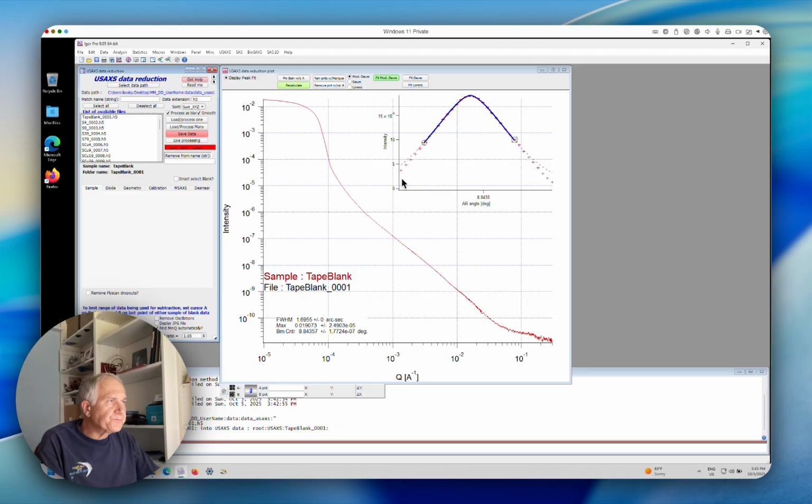And so what you see here on this screen is an intensity which forms a peak. This is normally the direct intensity of the beam, and in small angle scattering normally there would be a beam stop which protects the detector. In the USAXS instrument, there is no need to protect the detector. The detector can survive the whole beam, and so we scan through it.